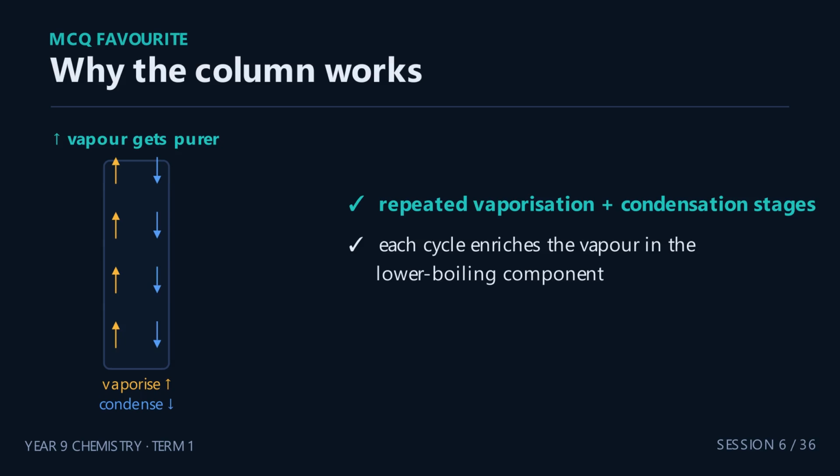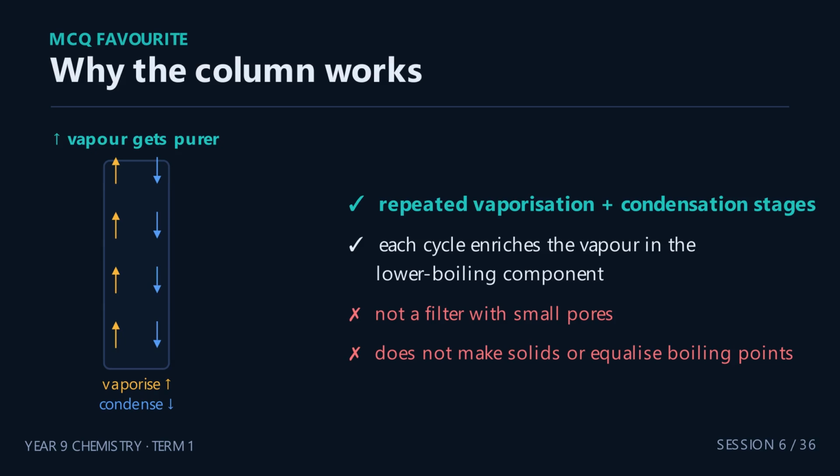Be careful with the wrong answers here. The column is not a filter with small pores. It does not turn liquids into solids, and it certainly does not give both liquids the same boiling point. It is repetition that does the work.